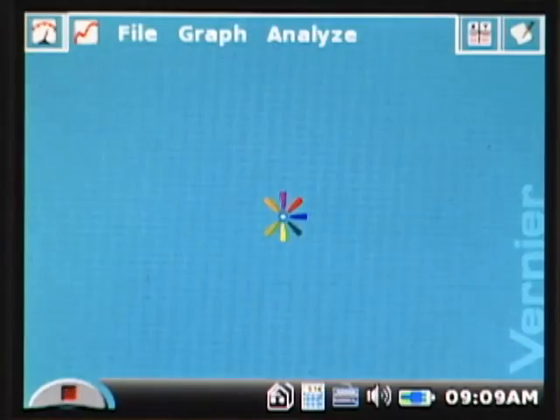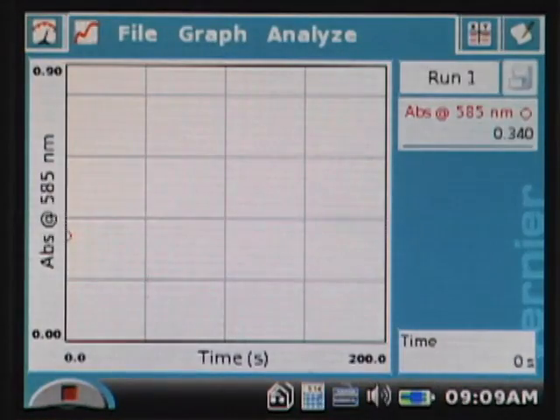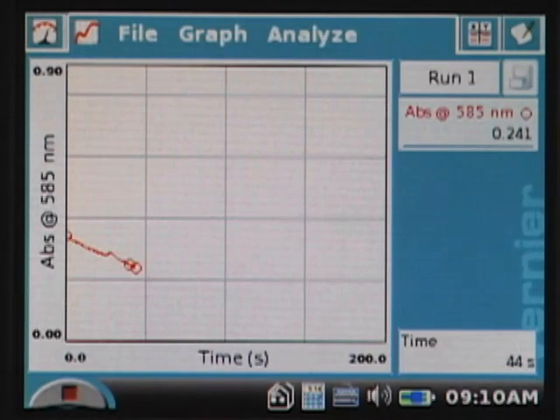I tap on the collect button and we go to a graph of absorbance versus time. You can see the data is now being plotted on the graph — the absorbance value is decreasing against time. We're now nearing the end of data collection at around 200 seconds, and you can see that the absorbance value has dropped to nearly zero.